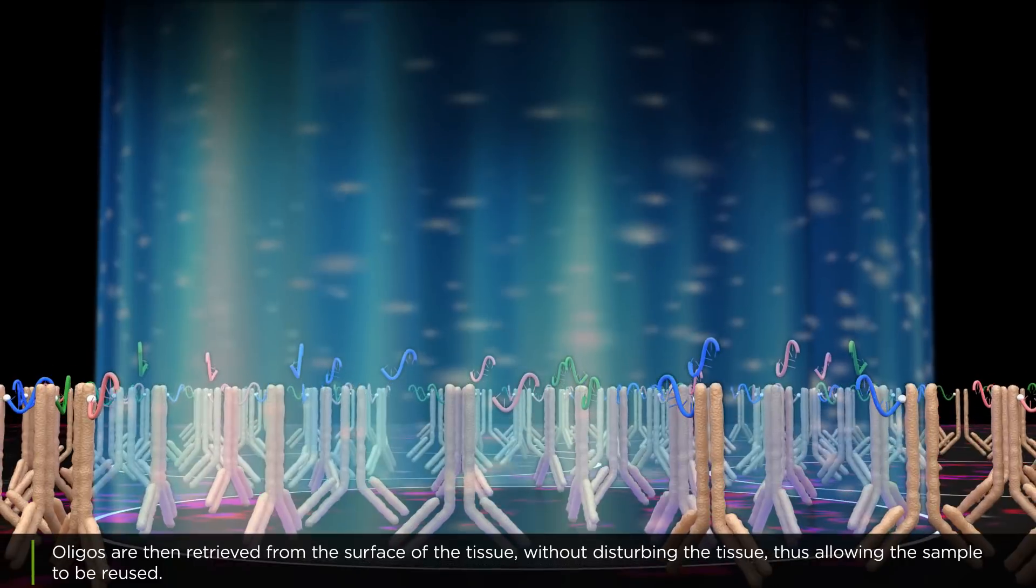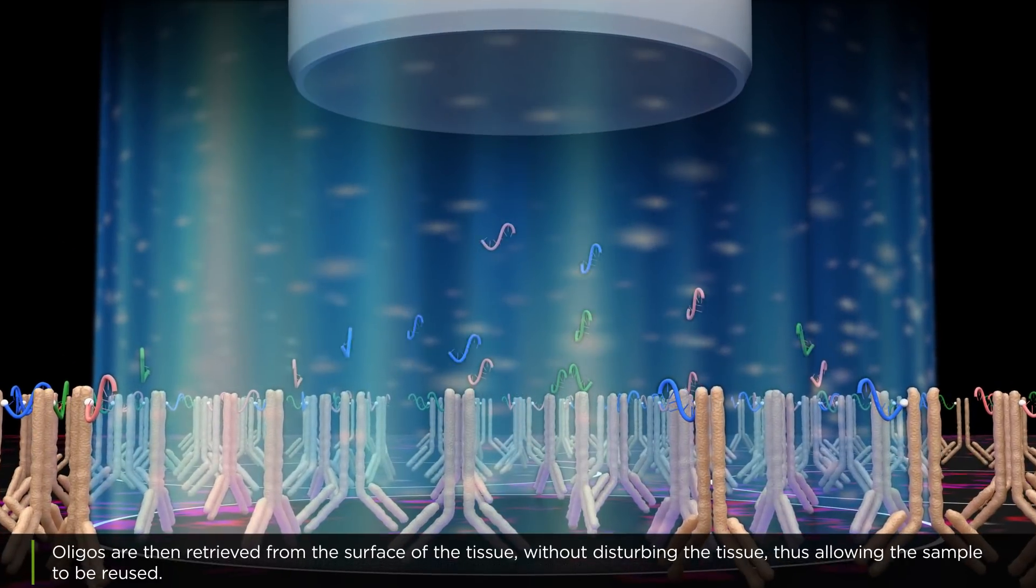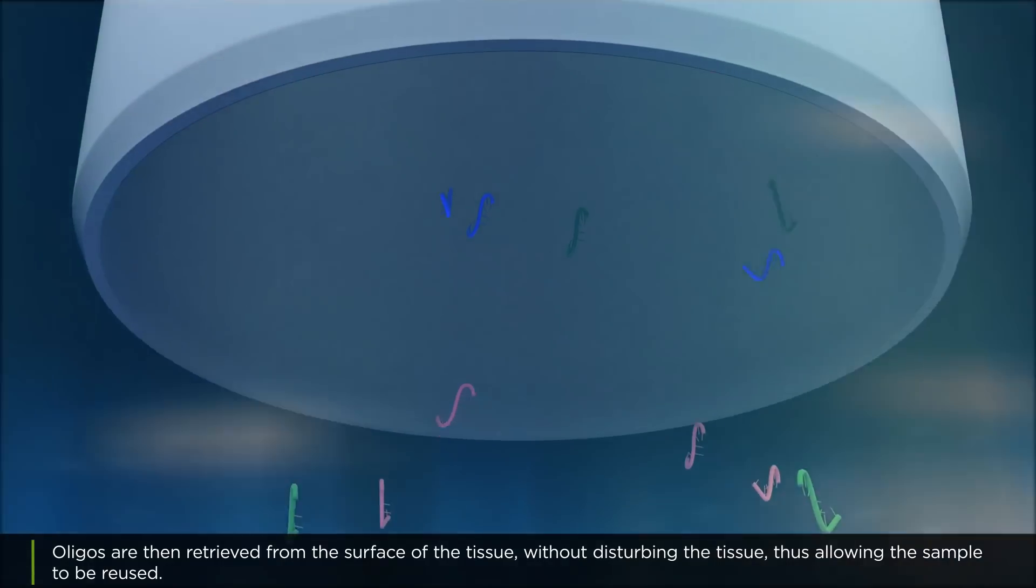Oligos are then retrieved from the surface of the tissue without disturbing the tissue, thus allowing the sample to be reused.